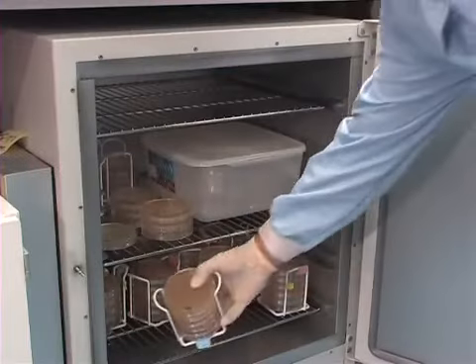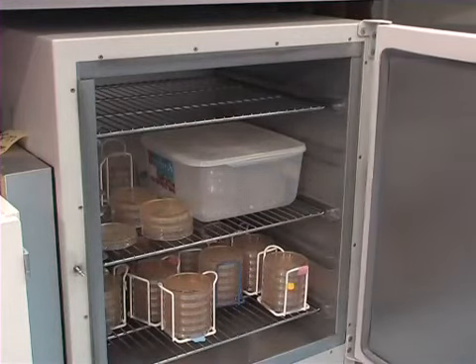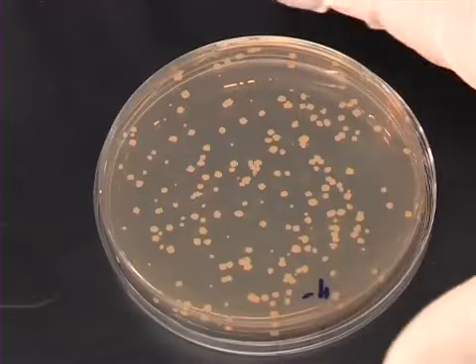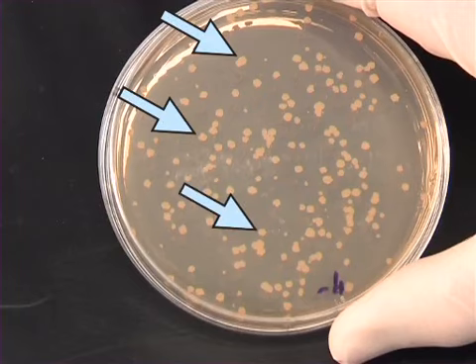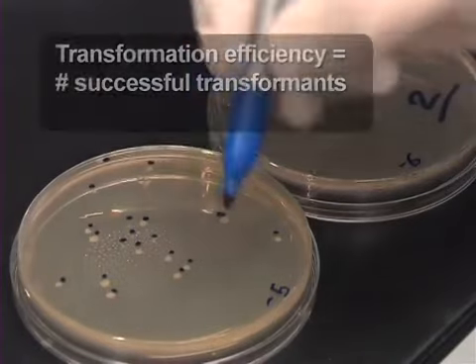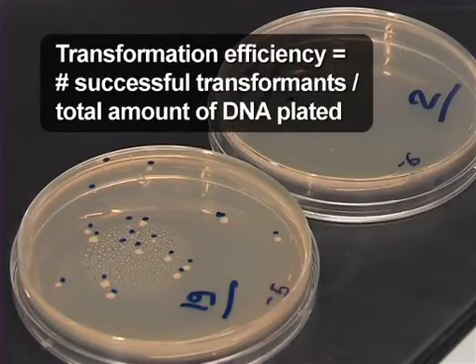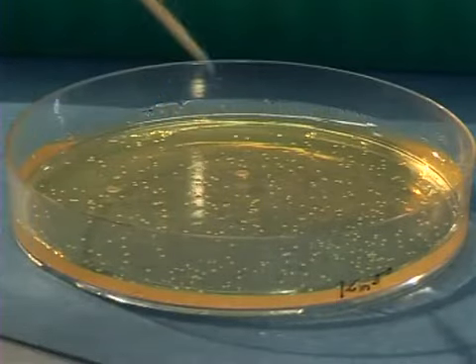Incubate the plates overnight at 37 degrees Celsius, upside down, to prevent exposure of the bacteria to condensation. The next day, the bacteria that have taken in the plasmid form colonies. Next, count the colonies to calculate the transformation efficiency, which is the number of successful transformants divided by the total amount of DNA plated. Now, colonies can be selected for further experimentation.